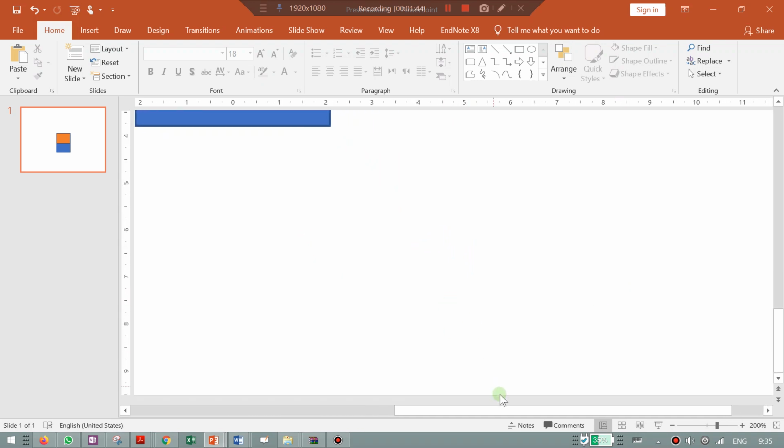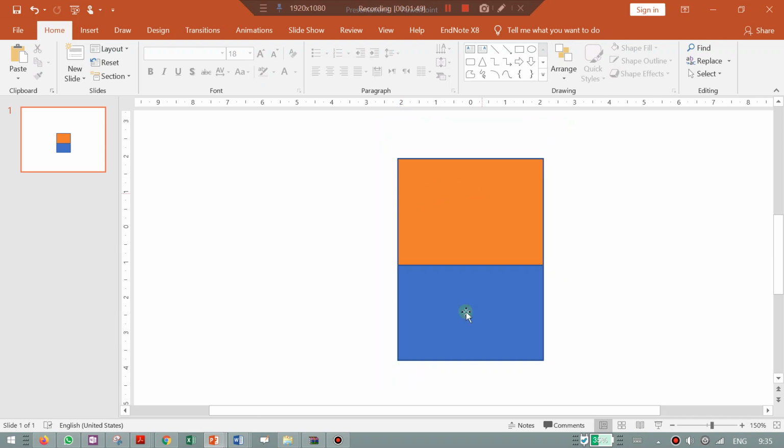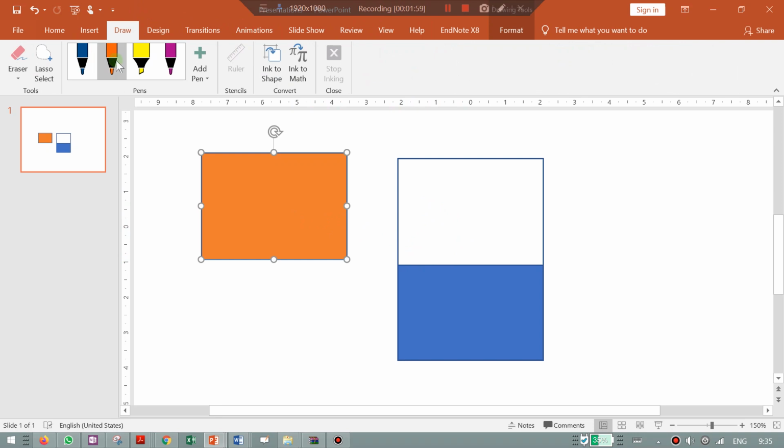Okay, let's make it bigger. Before we put our solvent of extraction inside the container, maybe we have the sample inside here. We have the analyte of interest inside your sample. Let's imagine the blue is your sample, and the orange dot is your analyte of interest, the compound of interest.